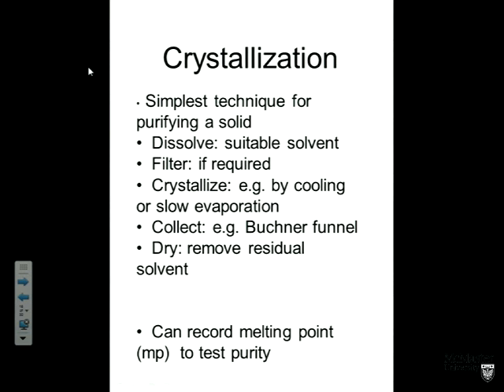So if we now move to solids, which we can't distill, we have an alternative classical technique called crystallization. So this is the simplest technique for purifying a solid. So we take our solid, we dissolve it in a suitable solvent, bearing in mind the like-dissolves-like rule. And so we would find a suitable solvent. We dissolve it in the solvent when it's hot. Okay, so we use the minimum amount of boiling solvent to dissolve the solid. We might filter if there's some insoluble junk in there. That removes the junk. But then we basically cool the solution.